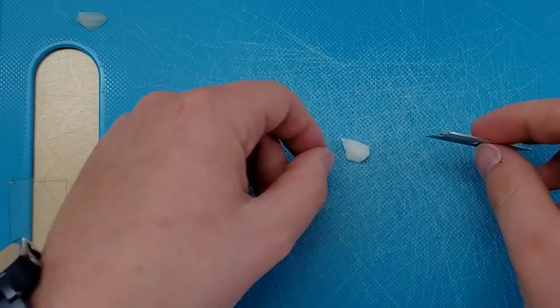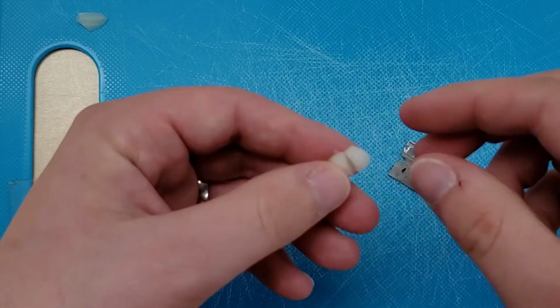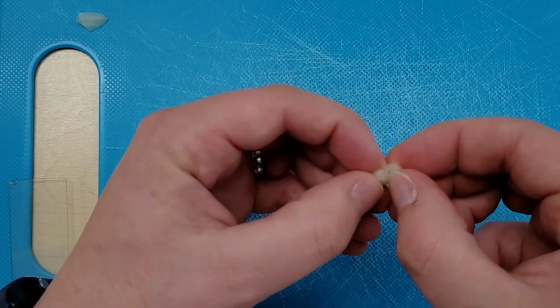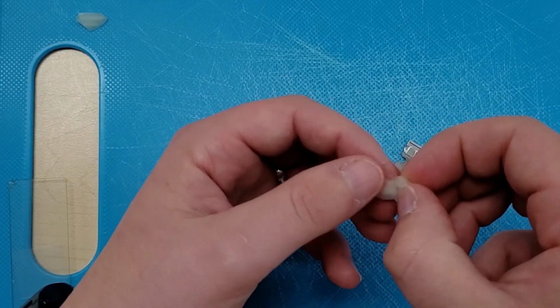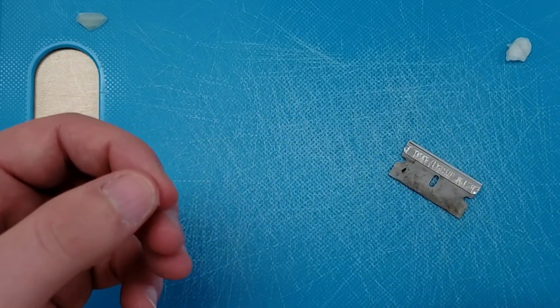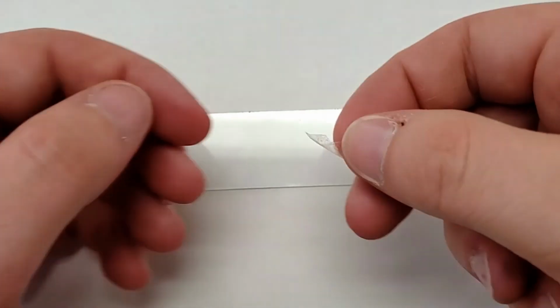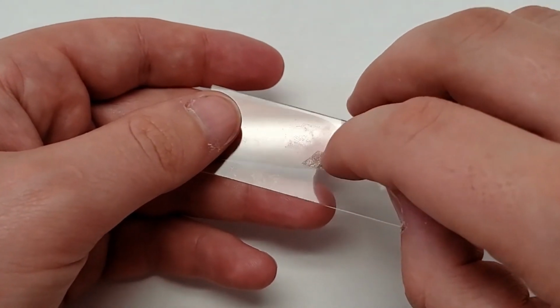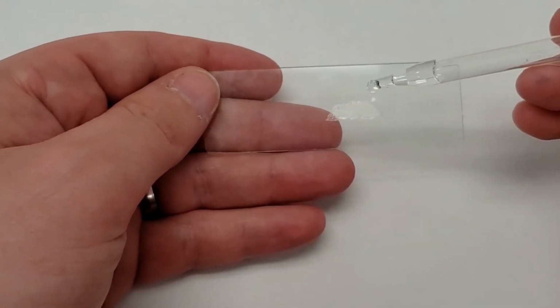The first step is to get a very thin layer of onion cells by cutting a chunk of onion almost completely through. Then we'll peel back half the chunk and now we should have our thin layer of onion cells. We will add this to a clean sample slide. If the sample slide is dirty, only clean it with a Kim wipe or some other lens-safe material. Now we can add a small amount of water using a dropper or a squeeze bottle.